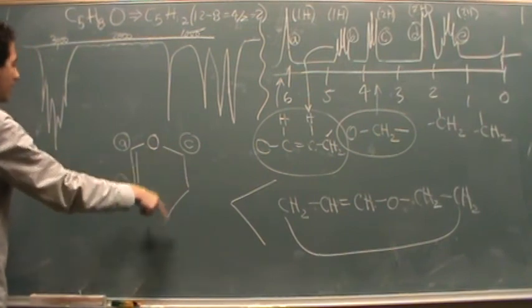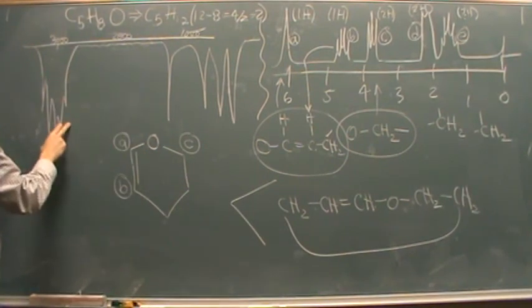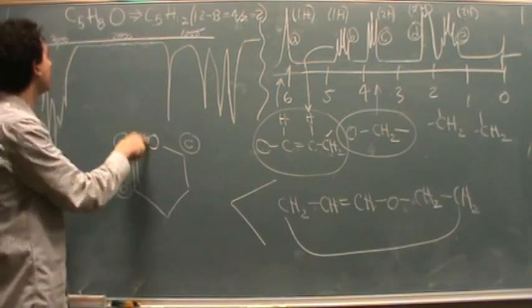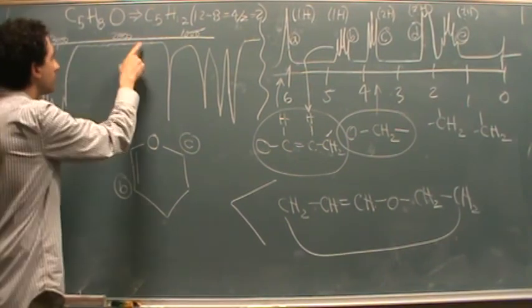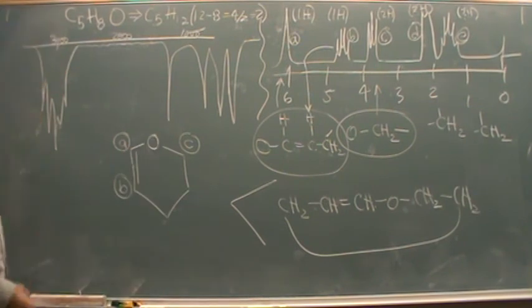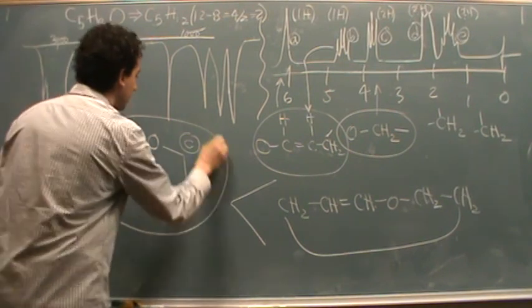The alkane parts are on the right-hand side, this lower part. And then I knew it was most likely an ether because there was no monstrous peak right here at the 1700 mark. This is more like at 1600, and it's not big enough. The carbonyl peak is huge and goes all the way to the bottom of the spectrum itself. So I believe this is our answer right there.